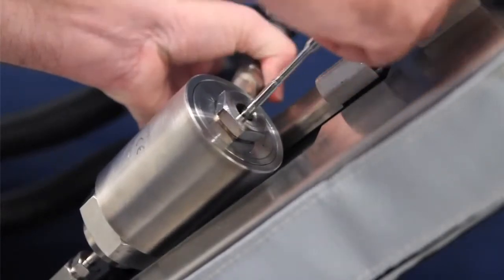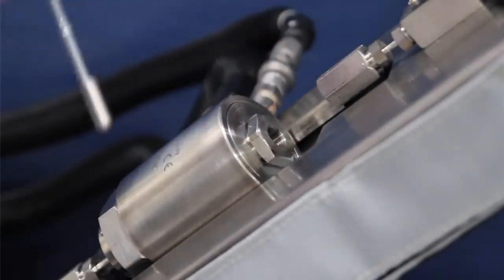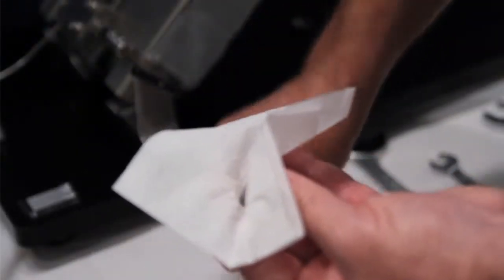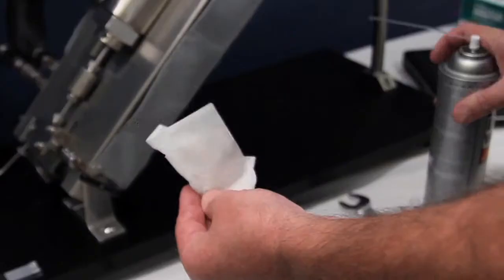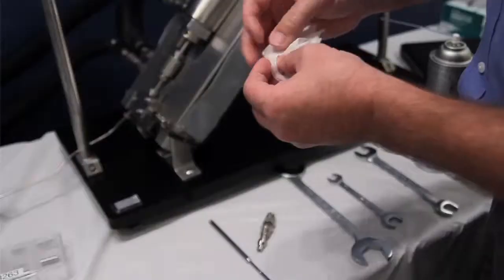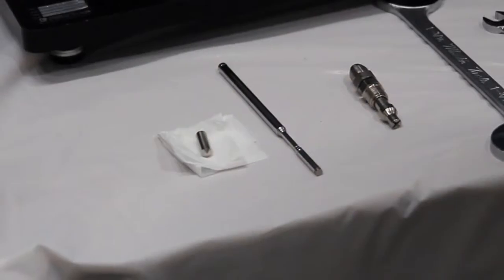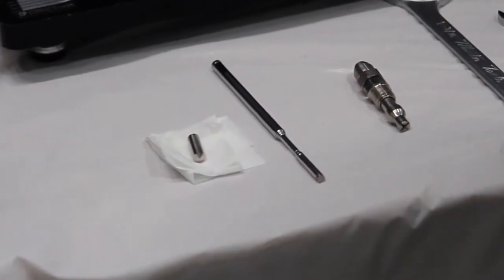Using magnetic wand, remove the piston by inserting the wand into the sensor's chamber. Place piston and kim wipe and dry. Use solvent to clean the piston. Dry piston with kim wipe. You have now completed the process of removing the piston.